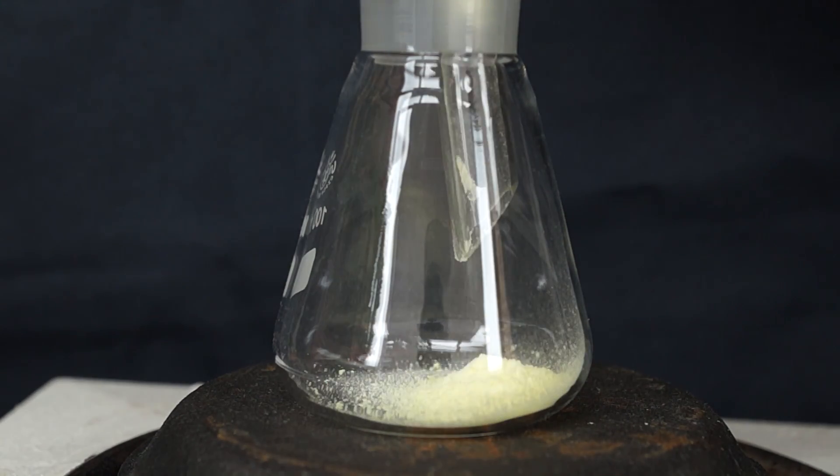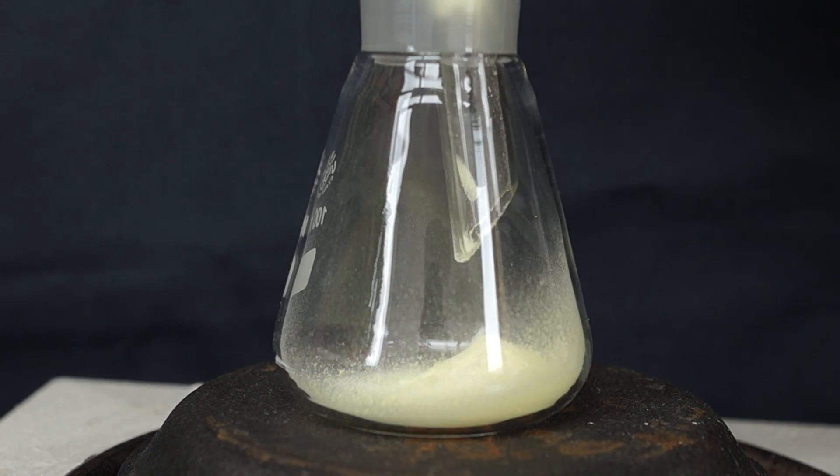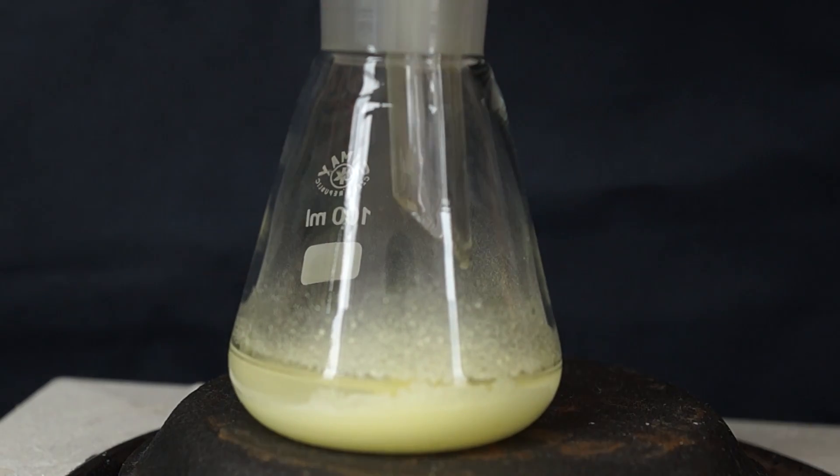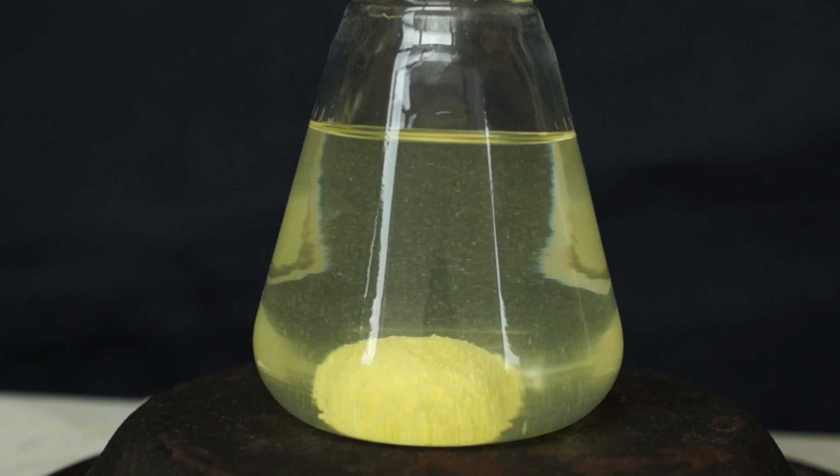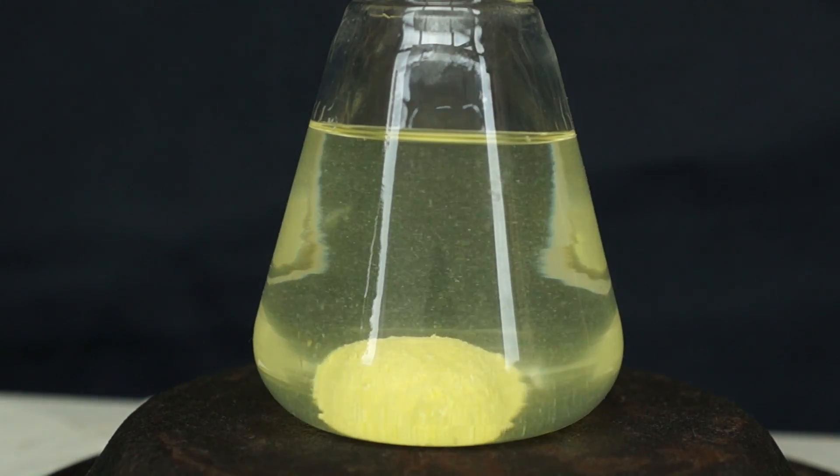Let's take a flask and fill it with 10 grams of crushed sulfur. Then we will need to pour about 100 ml of toluene into the flask and turn the stove on to heat up our mix.